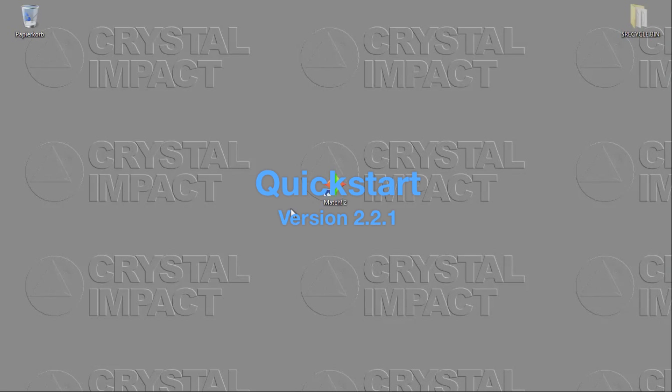Today I would like to demonstrate the basic workflow of the software to you. I assume that you are new to phase identification from powder diffraction data, or at least that you are new to the Match software and would like to learn how to operate it.